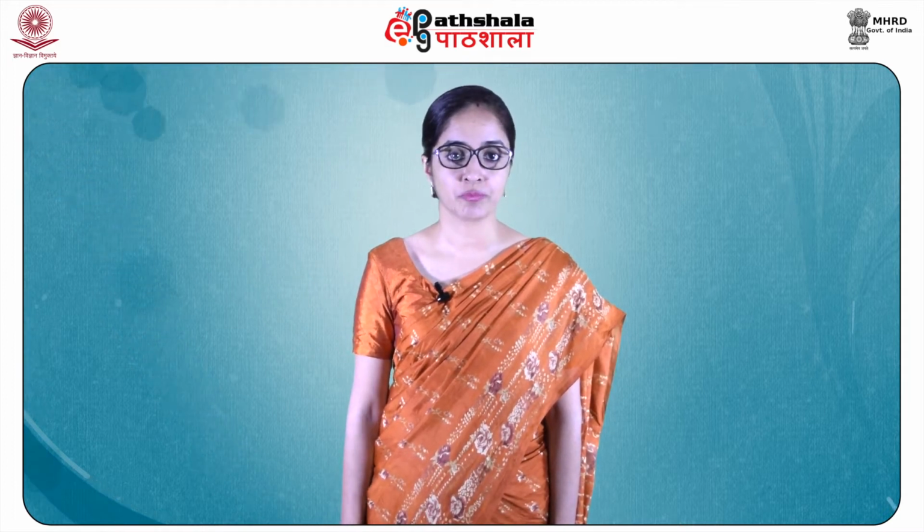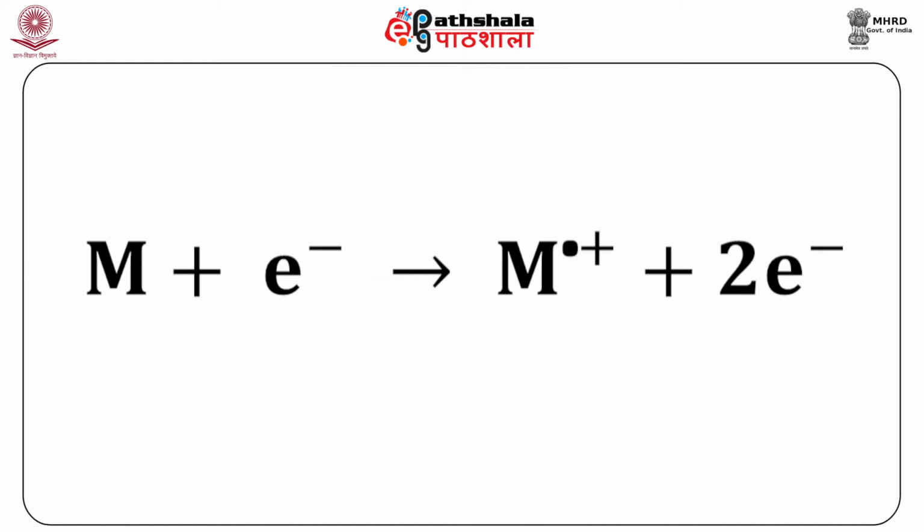The initial step involves the production of gas phase ions of the compound by a beam of energetic electrons. Deduction of an electron from a particular molecule M results in the generation of a parent ion, which we denote as M+. It is also known as a molecular ion. The parent ion's m/z value is equal to the mass of that compound. Now you can see in this reaction how the molecular ion or the parent ion is generated.